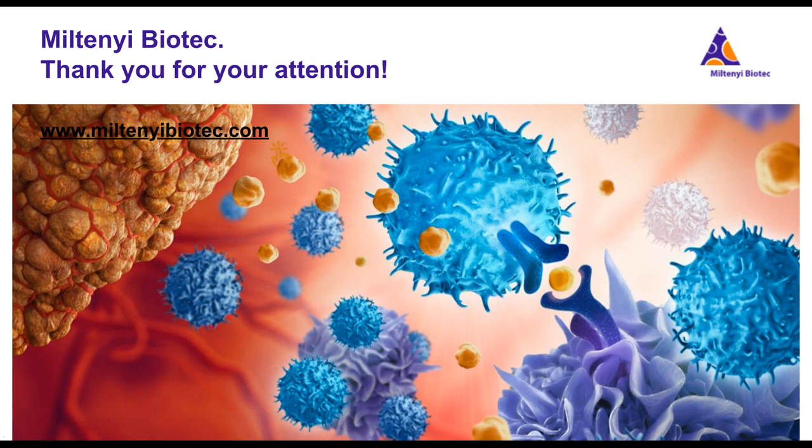For these mutation pools, we always offer two pools. One is the mutation pool, which covers the mutated sequence, and one is the respective wild-type control pool. So by performing separate stimulations with the mutation and the reference pool, you can then detect and analyze mutation-specific T-cell responses.